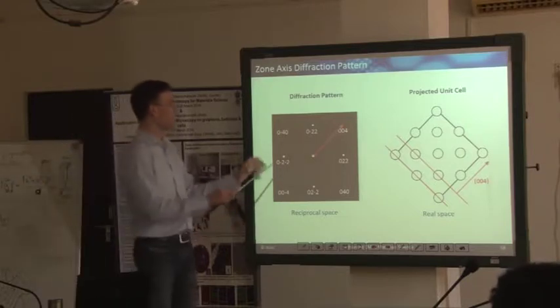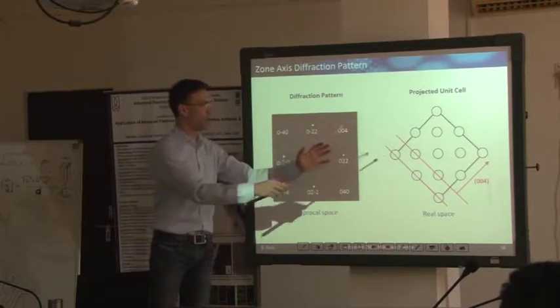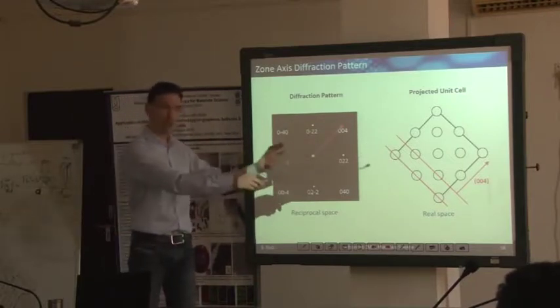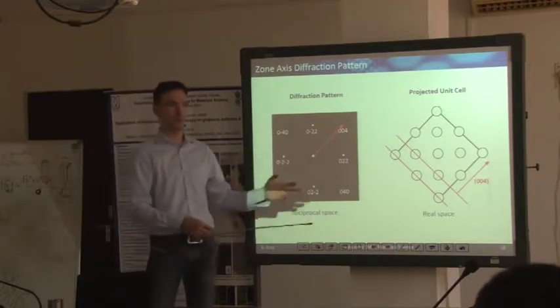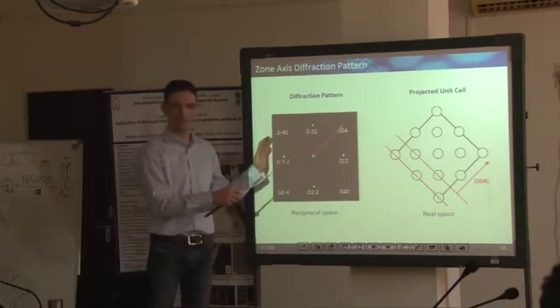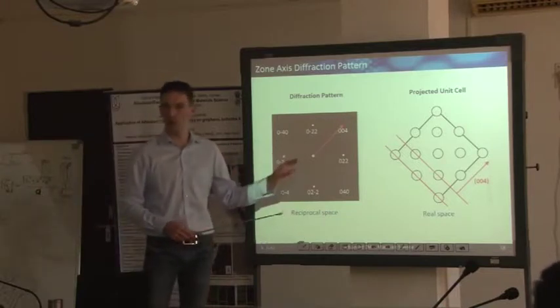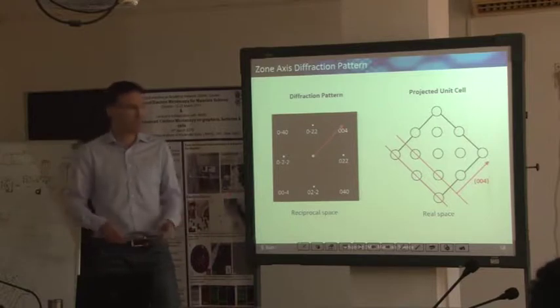And now we know that this reflection occurs from diffraction of these lattice planes. By that, if we know the material, we know what to expect in diffraction. If you don't know the material, you would rather start with chemical analysis before you do a diffraction experiment to get into the details. But let's assume that you don't know the crystal structure of your material. This is a common question.